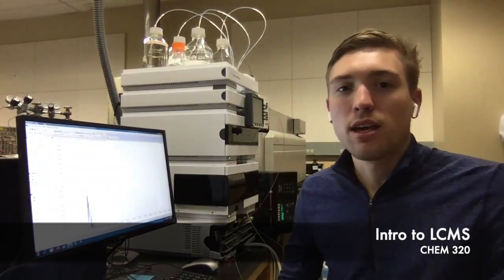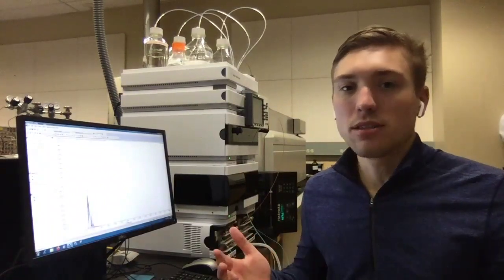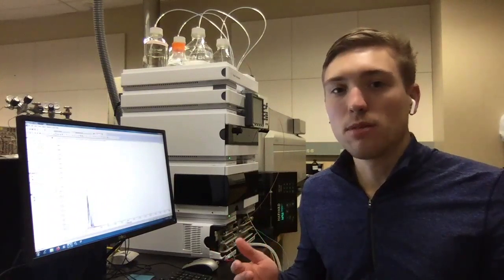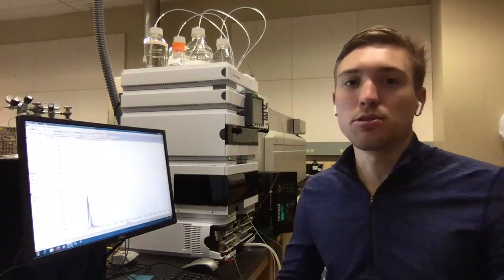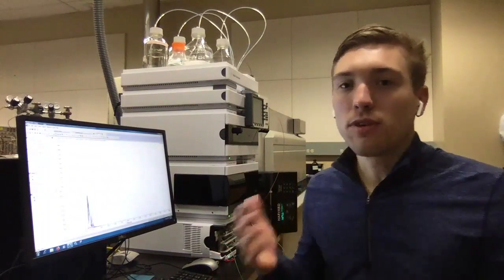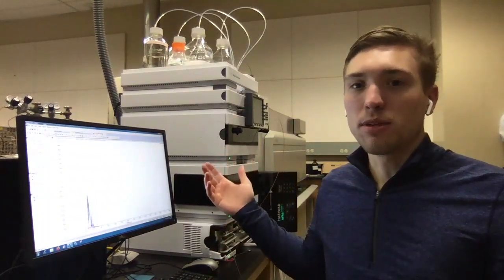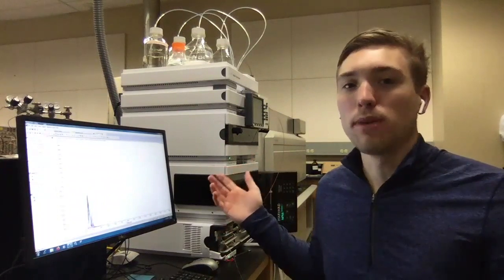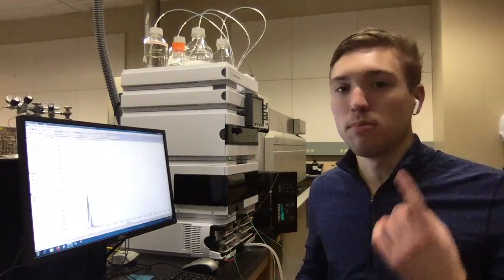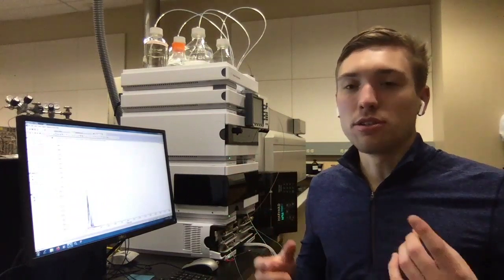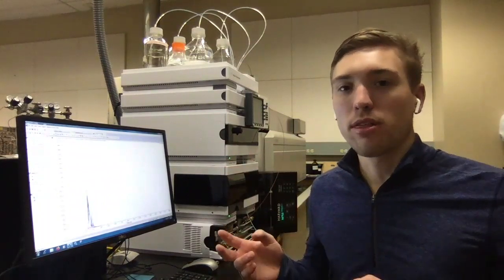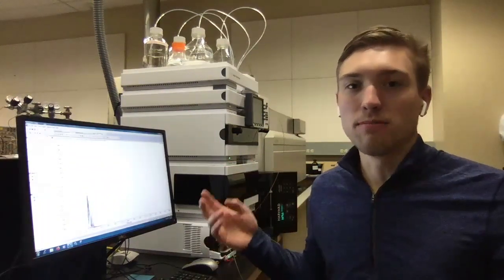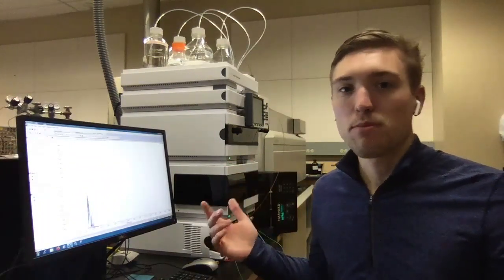Hi everybody, I'm Jack, and today I'm just going to walk you through some of the basics of the LC-MS here. Dr. Propescu just wanted me to talk to you all about it because I have some research experience on this instrument. So first off, we have the Agilent HPLC system here interfaced with a triple quadrupole mass spectrometer, and we can really combine some of the benefits of both HPLC in terms of chromatographic separation and then pair that with the very sensitive and selective methods of mass spectrometry.